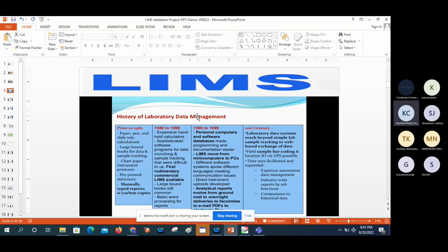All people are aware of what paper based is and what the electronic systems are. Paper based means we write manually for all the documentation we received from the quality assurance department, and once the analysis is performed, we document simultaneously and in parallel, as many organizations are still following currently. But prior to 1980, there were no electronic computer systems, so they always followed paper based.